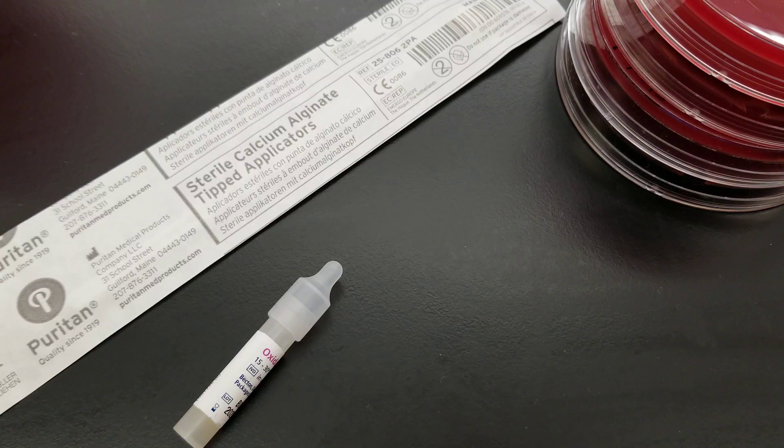In the case of a positive, there would be a purple or blue reaction, and if it was negative, there would be no color change.